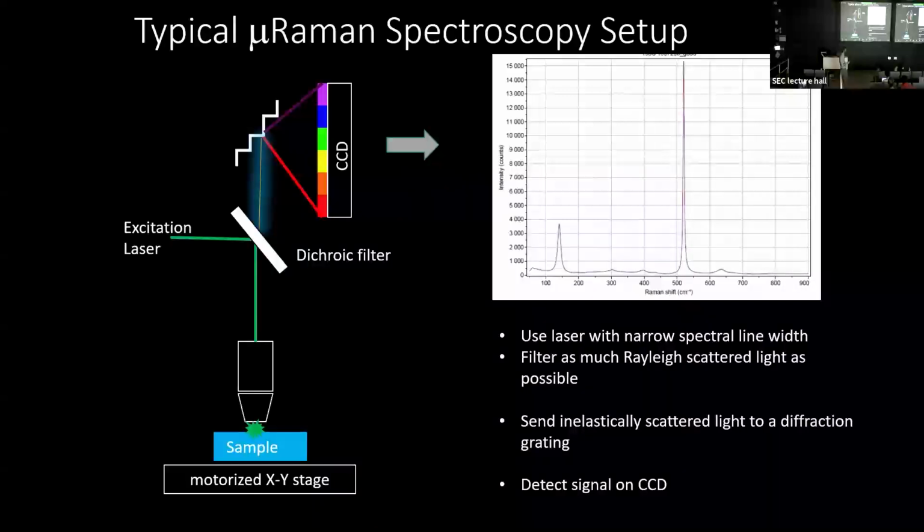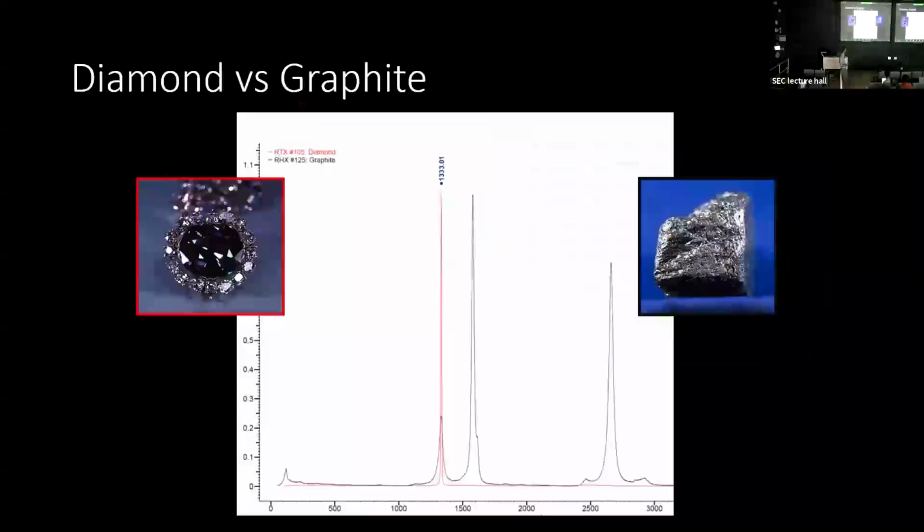And then the picture of the rainbow, we just take a line scan across, and we have lots of photons at this wavelength, lots of photons at that wavelength. We plot it in Raman shift. We set the 0 as our excitation line, so it's always a shift from wherever our excitation line is. And then we can chemically tell what the sample is.